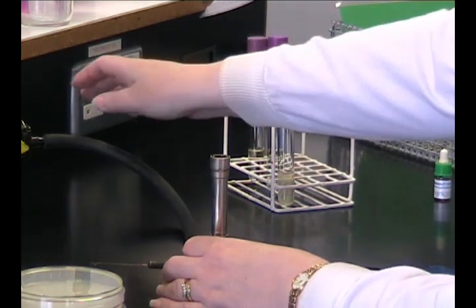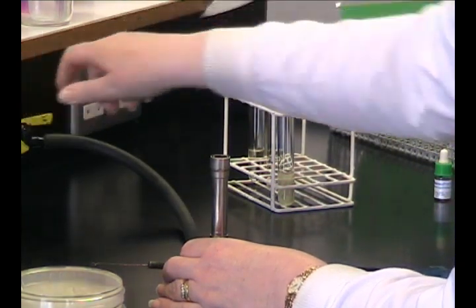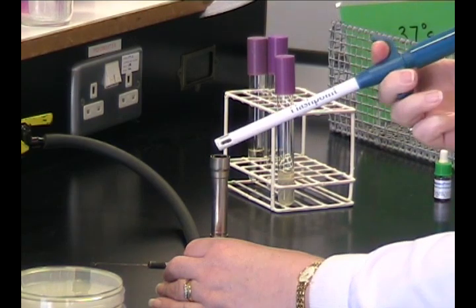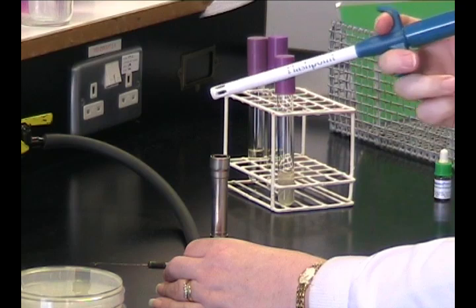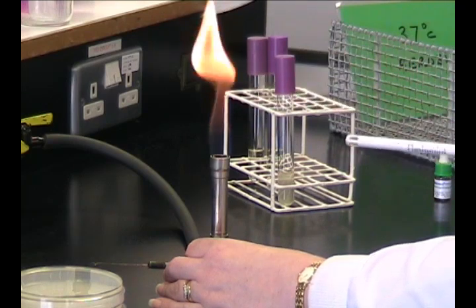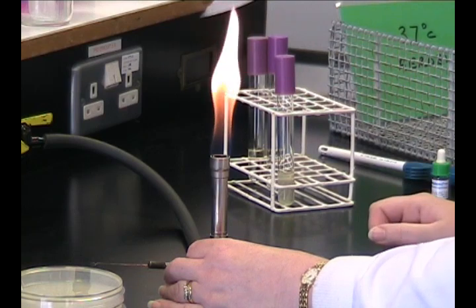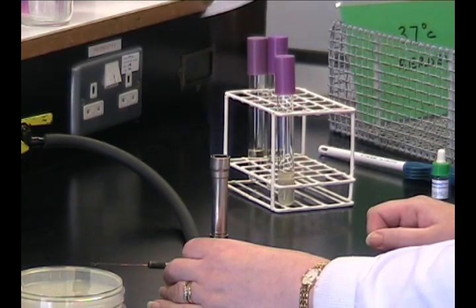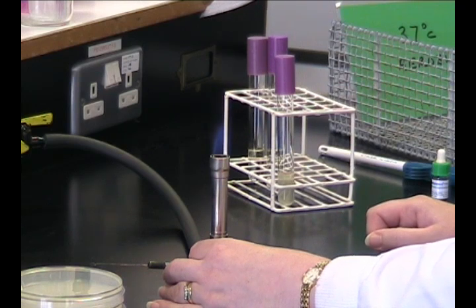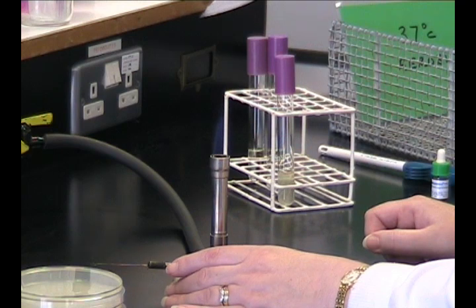The first thing to do is to light your Bunsen burner. Turn on the gas, make sure the air hole is closed and use the gas lighter provided to light the gas. When the air hole is closed, the gas and the flame will be cold and yellow. When you want to use it, open the air hole up and you'll get a nice bright blue cone of gas.